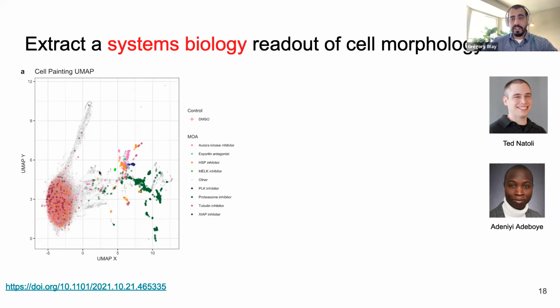But remember, this is a single cell line, A549, perturbed with a whole bunch of different categories of drugs. So these in green are proteasome inhibitors at fairly high doses. These tend to be very disruptive in cells and therefore cause very distinct cell morphologies, and a whole bunch of others that we chose to highlight, which ended up having fairly high signal in our data.